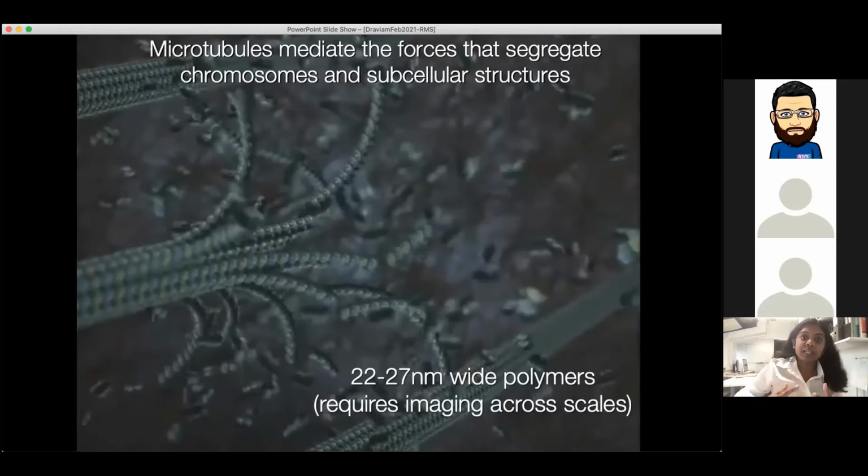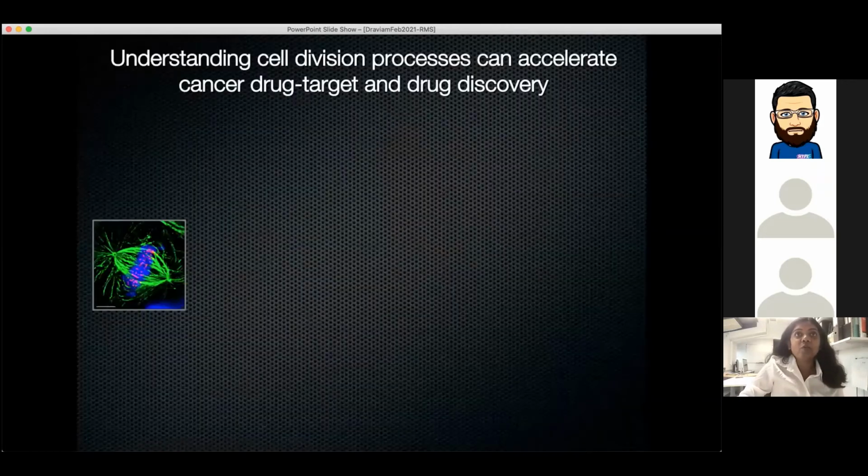There is another important scale that I want to emphasize, which is the temporal scale. So microtubules grow and shrink in the range of microseconds or milliseconds, whereas the spindle itself moves and pulls and pushes chromosomes in the order of seconds. So there is a scale difference in terms of time as well. These two structures behave very differently, right? Now that means for microscopists like us, it's a complex problem of not only optimizing for that temporal resolution, but also optimizing for the spatial resolution. And I want to throw one more complexity into it, which is, if we move forward, the spindle. So what you see here is the mitotic spindle.